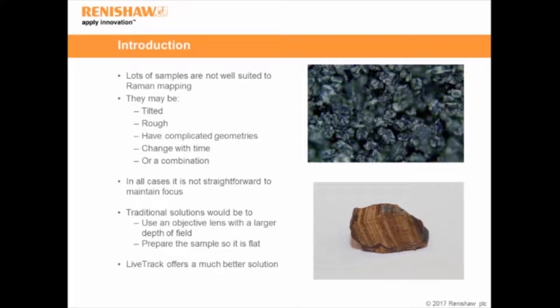Unfortunately, lots of samples are not well suited to Raman mapping — they can be tilted, rough, have complicated geometries, they might change with time, or it might be a combination of these things. As illustrated on the right, I've included an image of a lithium-ion battery electrode made out of carbon, and you can see here, even over this small area of about 20 microns in size, regions where we're in focus and out of focus.